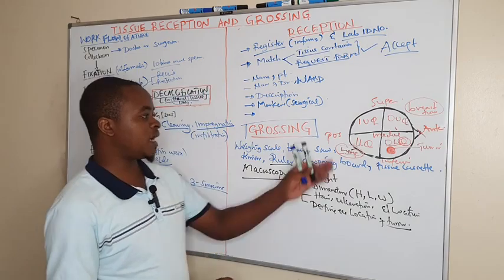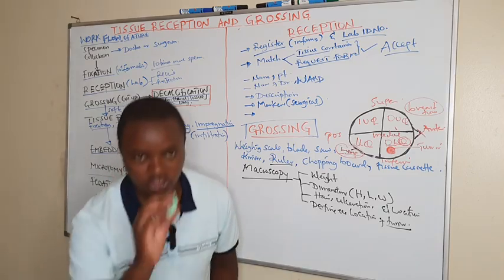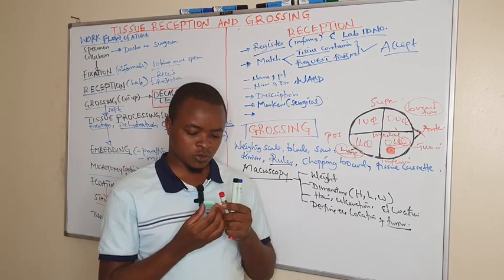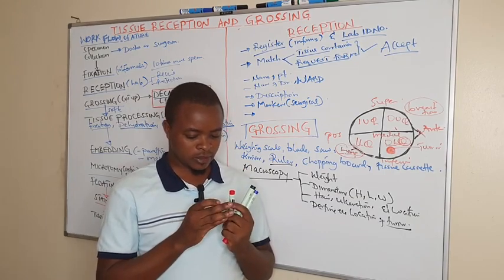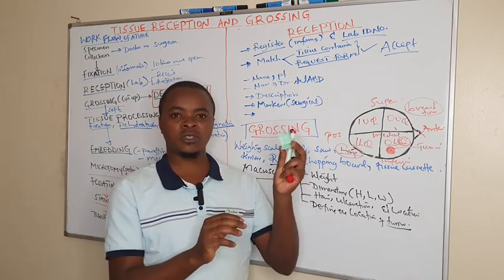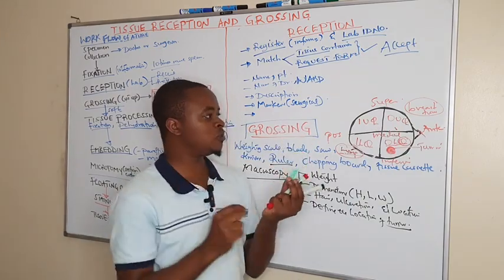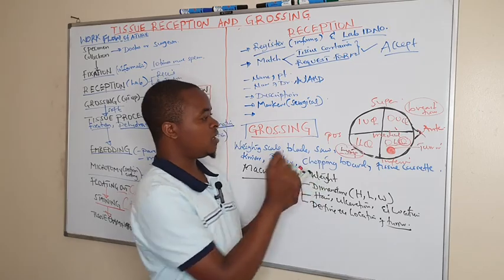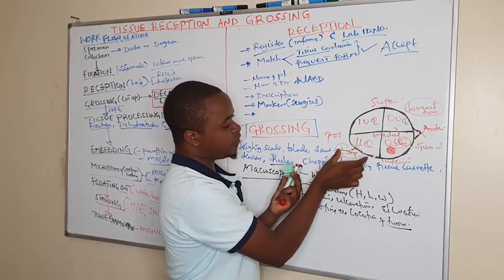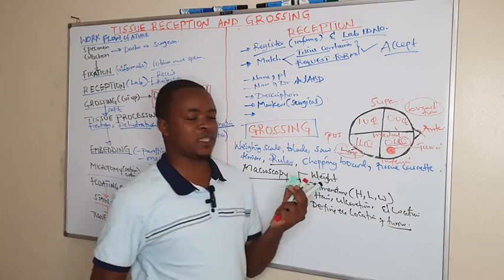And after describing, as we are cutting different sections, we keep cutting sections as we place them in the tissue cassette. You sample the sections you cut in the outer quadrant, you sample the nipple, you sample the lymph nodes position, and even you sample where the tumor is located.